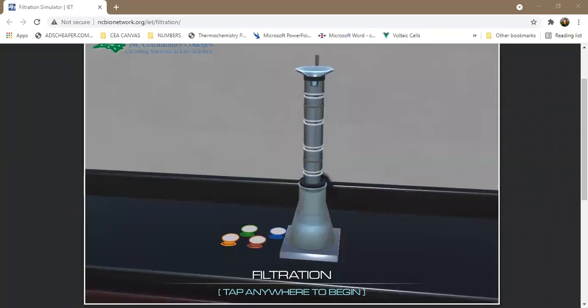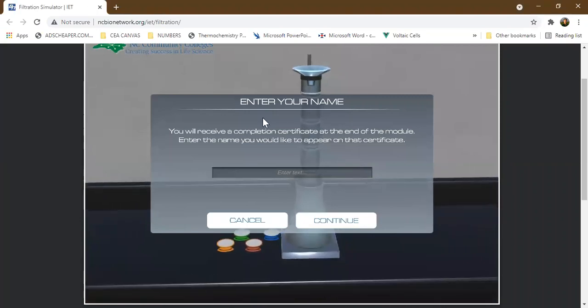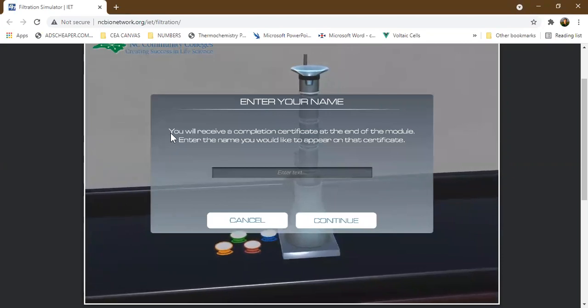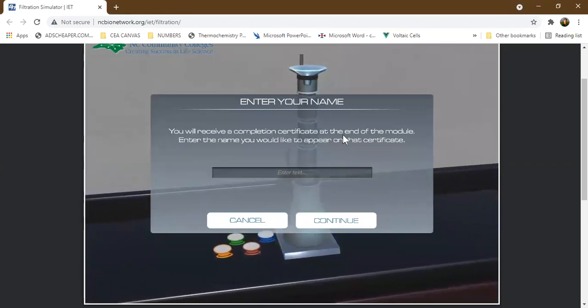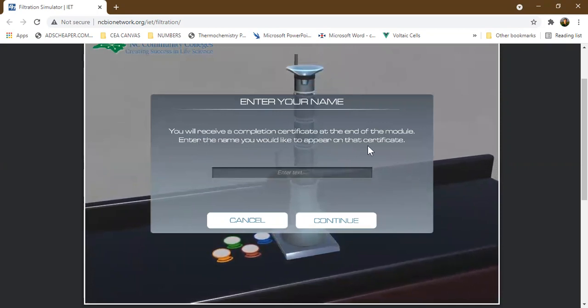This video is a walkthrough of our virtual simulation, which is filtration. Once you click the link posted on our LMS, we are going to be led to this dashboard. The first thing we're going to do is enter our name. Why? Because you will receive a completion certificate at the end of the module. Enter the name you would like to appear on that certificate.